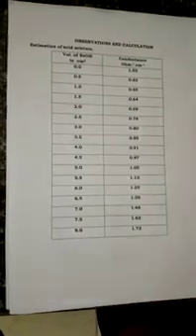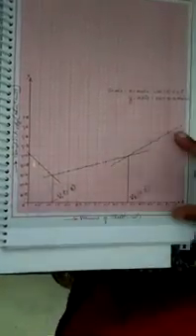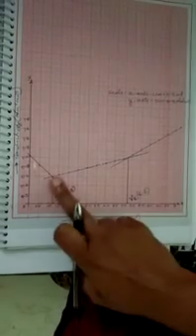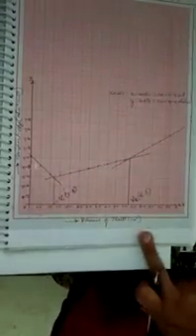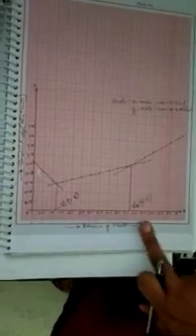Now when you plot a graph of volume of sodium hydroxide against conductance, you can clearly see the points here. There is a decrease, a gradual increase and a sharp increase. When the intersections meet the x-axis, you get the two volumes which are called V1 and V2.